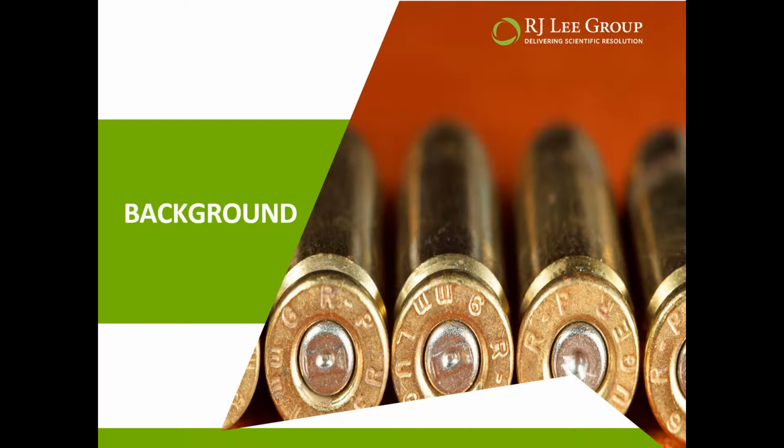So think about it as if you were making a cake. You've got all your different ingredients: your sugar, your flour, your water, your eggs, all the stuff that you need to make a cake. And you mix that all together and you get this lumpy batter. In the plume, we've got our lead, antimony, and barium mixed together, creating one particle type, a primer gunshot residue particle, a 3-component primer gunshot residue particle.